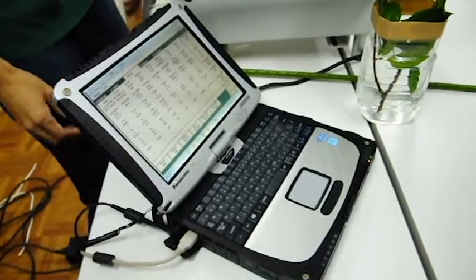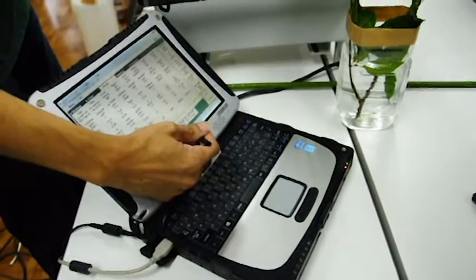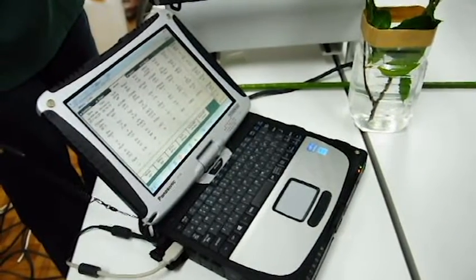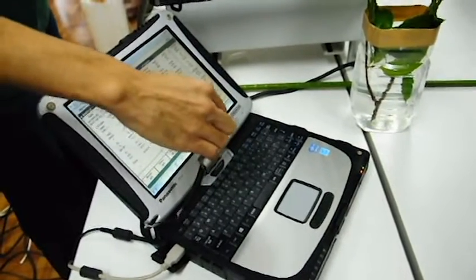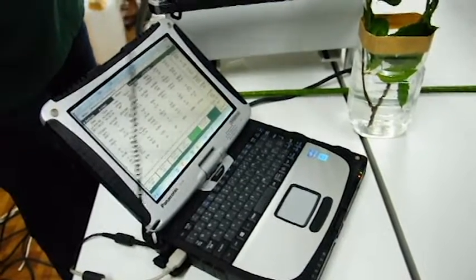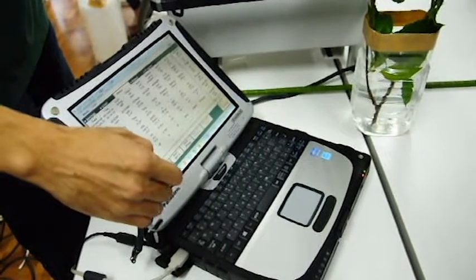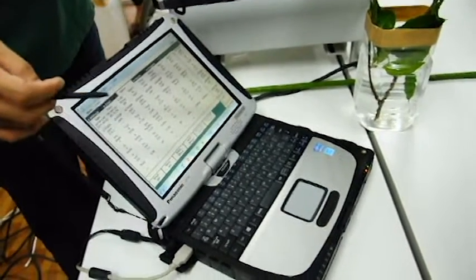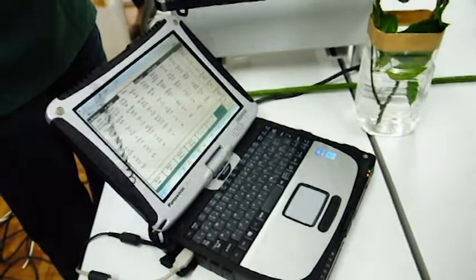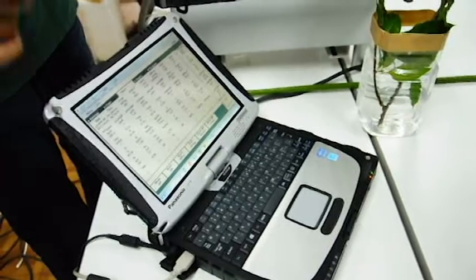And then push this button. Store the FVFM. Okay. And then push. Yeah, this is a very strong light, but a short light. Yeah, just finish. So chlorophyll fluorescence measurement is very convenient, easy to measure.